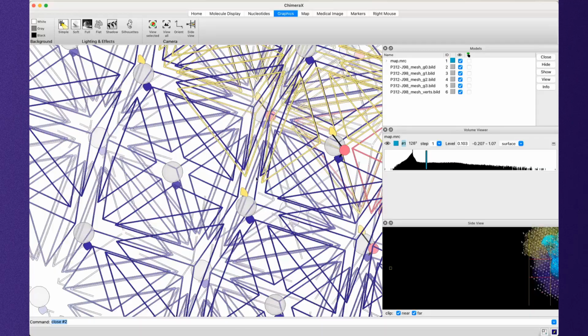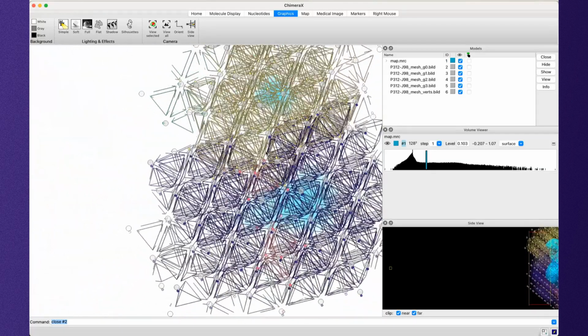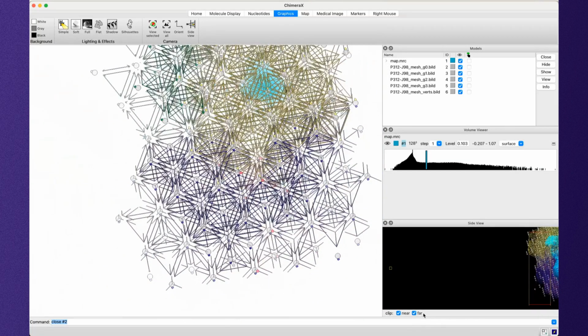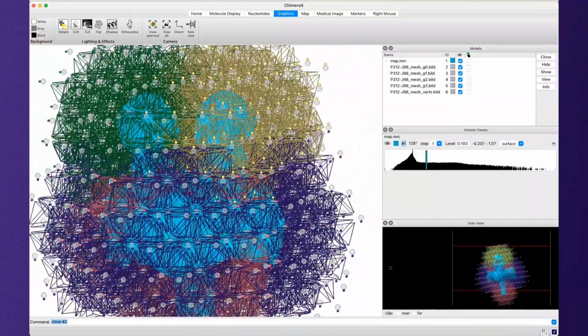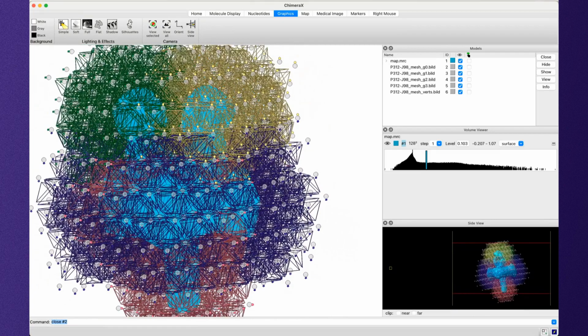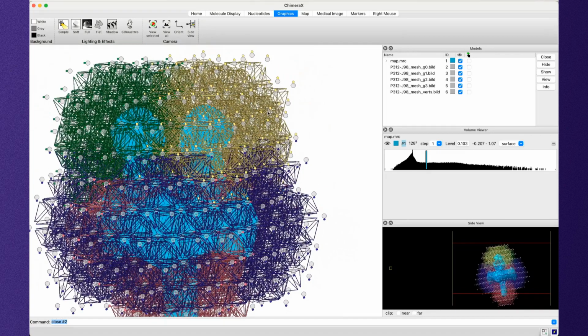And that's because if we zoom out, the yellow and blue meshes are the micelle in blue and the fab in yellow. And we didn't fuse the micelle and the fab. Okay, so it makes sense that we're allowed to move those independently. We want this fab to be able to flex left and right without worrying what the micelle is doing.